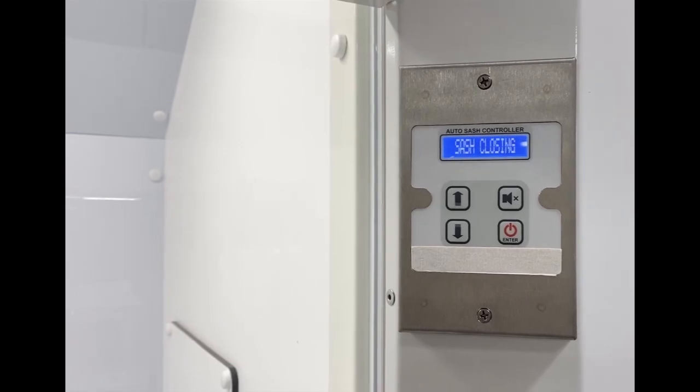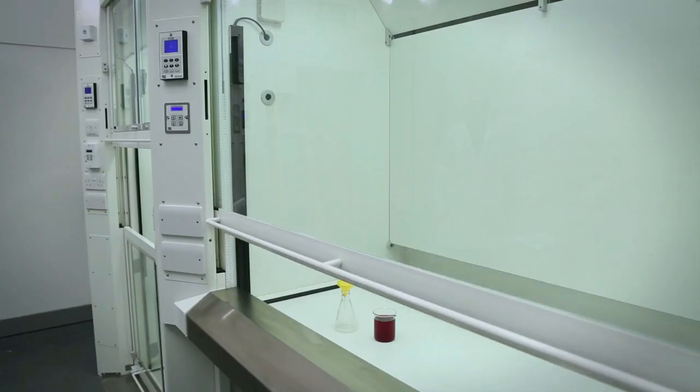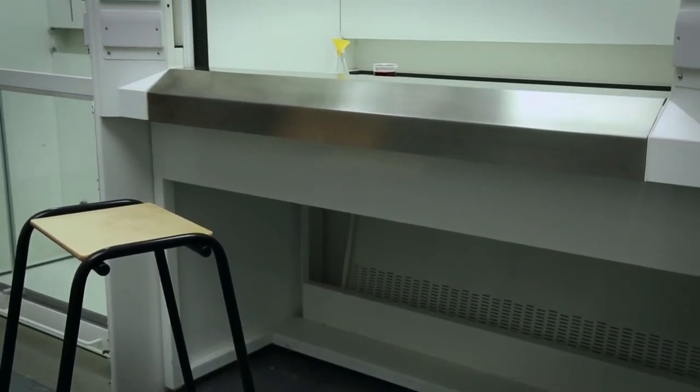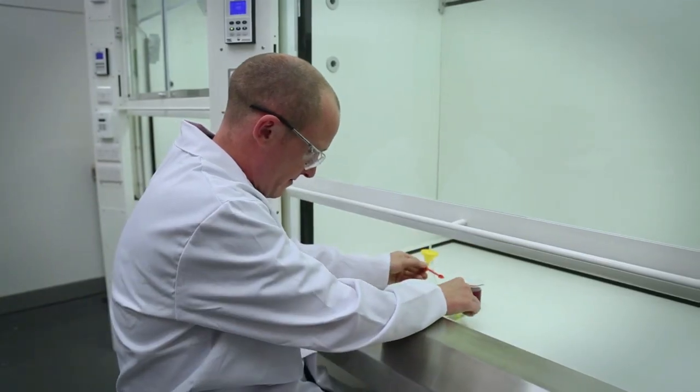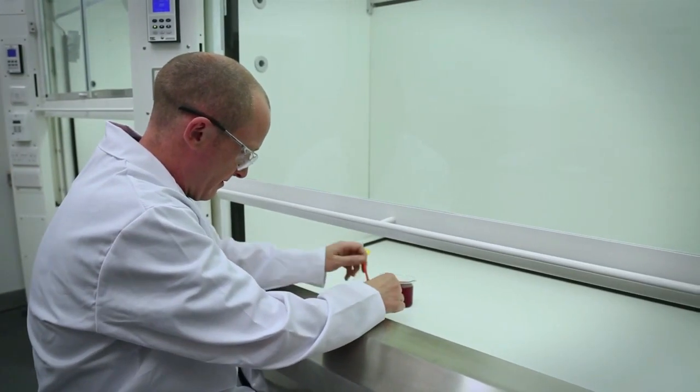Auto sash controller is designed to close the sash automatically when the operator is not present in front of the fume hood. Passive infrared sensor constantly monitors the work area in front of the hood. The system also detects the presence of the user without continuous movement.